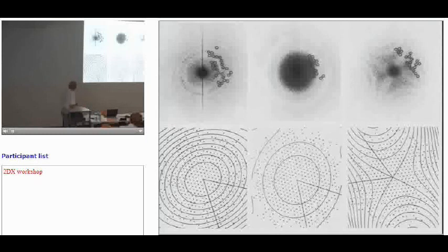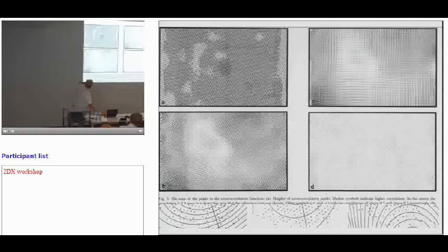So that was included. And then eventually, Fritz Zemlin in Berlin got their microscope to be reliable, and this is one of the very first. So we had these 3 images, with different degrees of astigmatism and defocus and so on, from 3 different microscopes, and they were merged together really nicely in this 1986 paper, where we were doing this sort of thing for the first time.